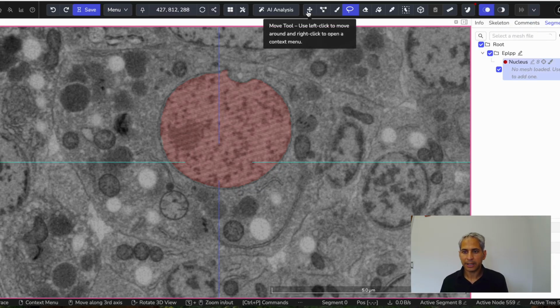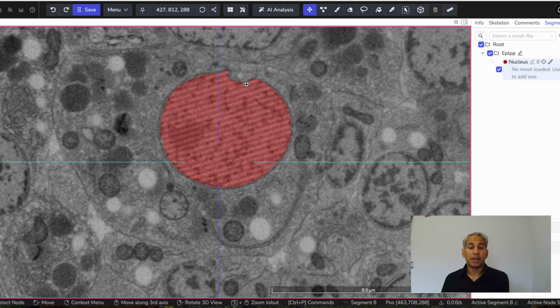And then let's go back here. I'm bringing this up because as you start to get used to your cell, don't shy away from acknowledging, oh wow, this is cool. That's the beginning of a question, of a hypothesis, of perhaps a discovery. So when you see something strange, according to your standards, ask other people in your rosette, hey, do you see this in your cell? And if nobody sees it in their cell, you may be onto something.